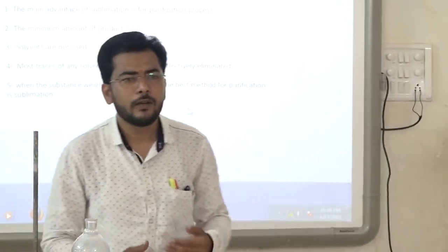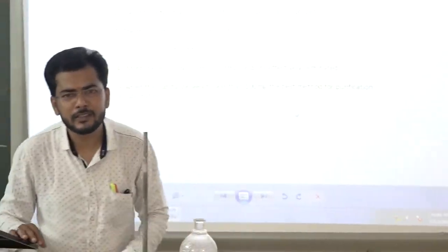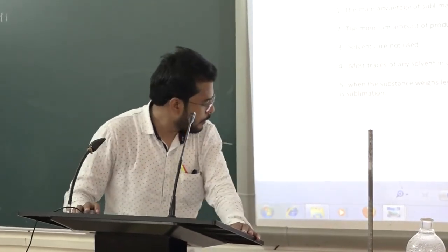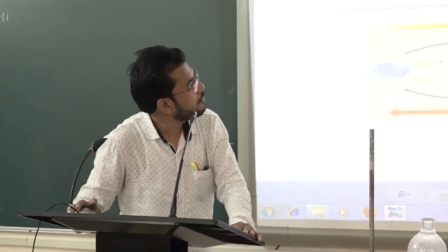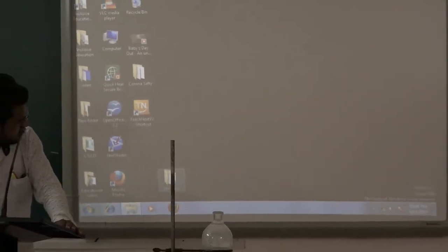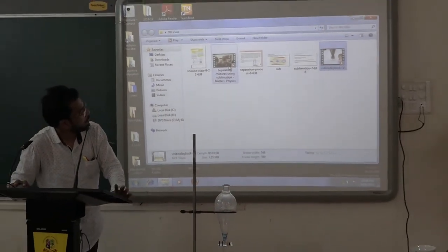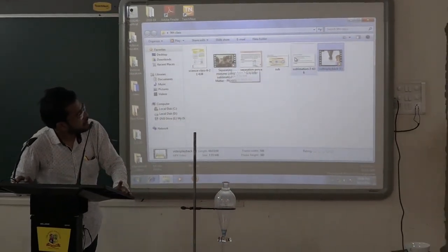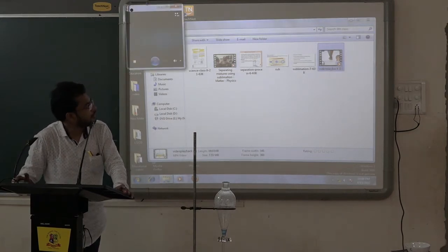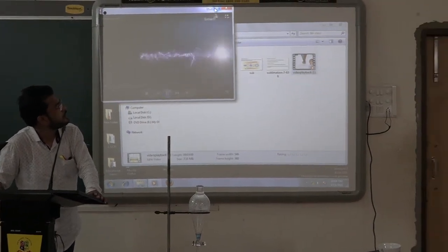So in this way, we don't have so much time, that's why we are just stopping these things. We will see these two methods with the help of AV also. So let's watch both AVs. First we will see the separation method by using a separating funnel. So we will get more clear about this.